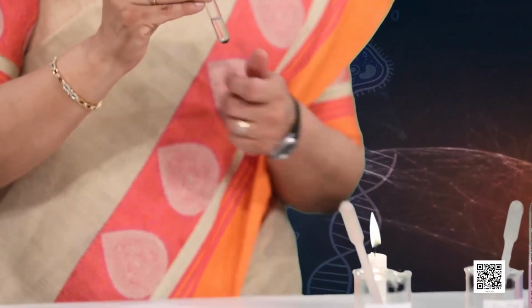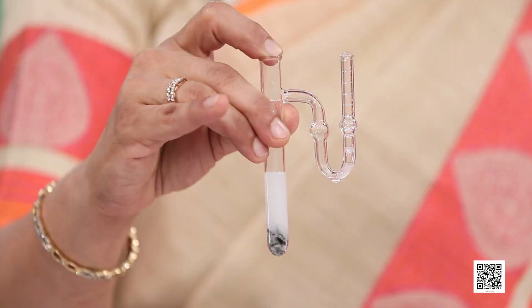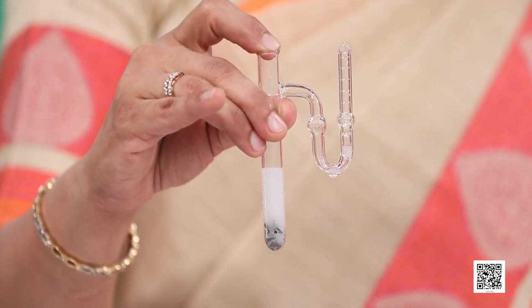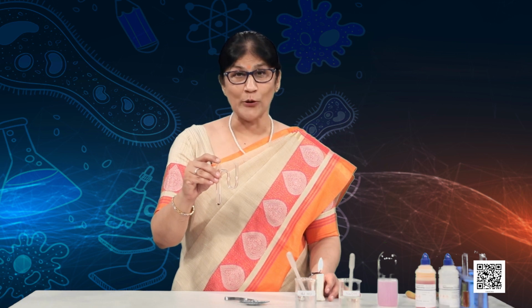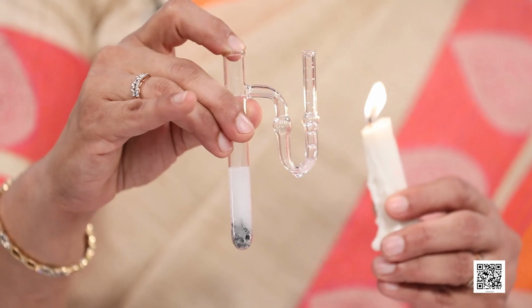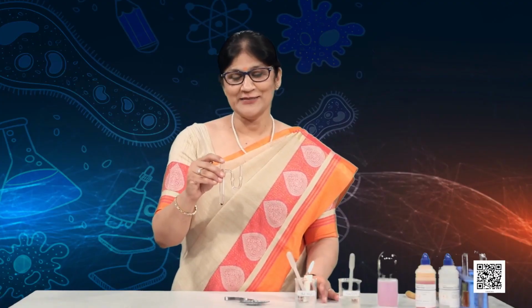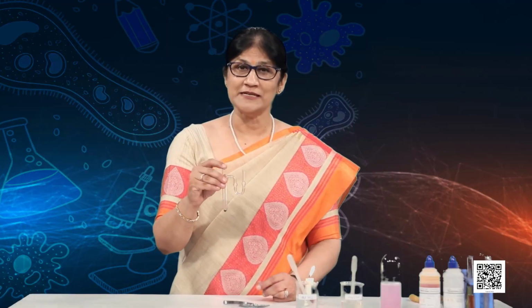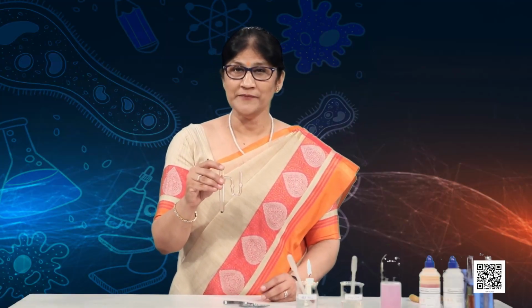We will warm it a little because the reaction is a bit slow. Okay. So, after warming, now you can see that the gas bubbles are rising. We will check these gas bubbles too. Do these gas bubbles also burn with a pop sound? Yeah, you heard that? The pop sound. So, whether acid or a base, both react with metal to give salt plus hydrogen gas. Let us see the next reaction.